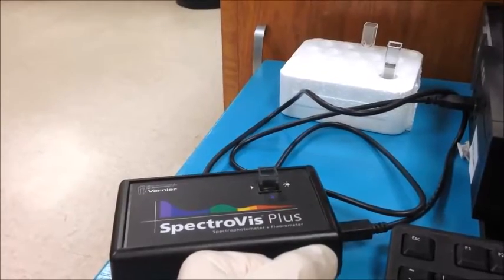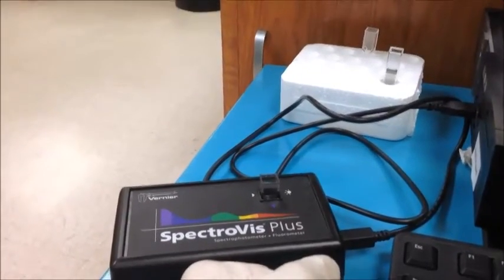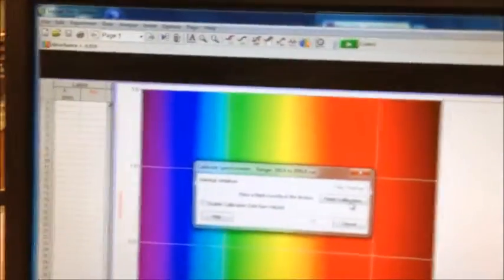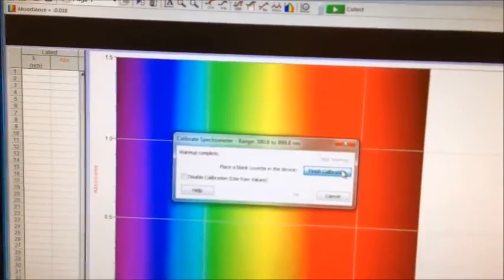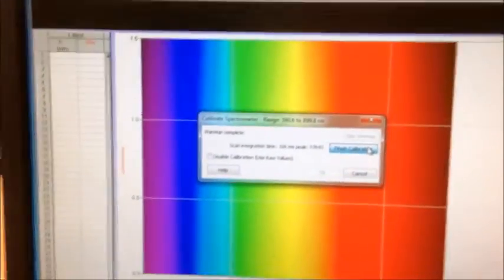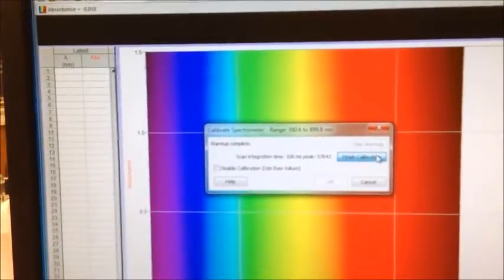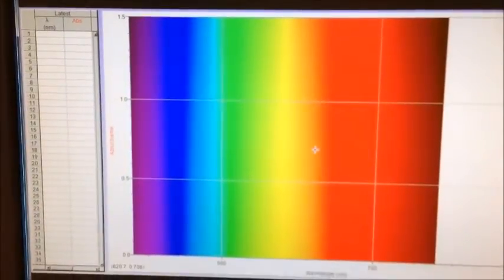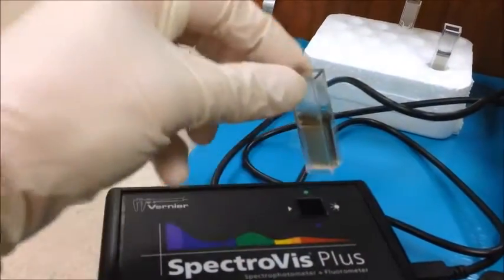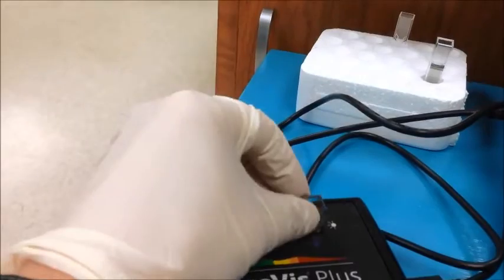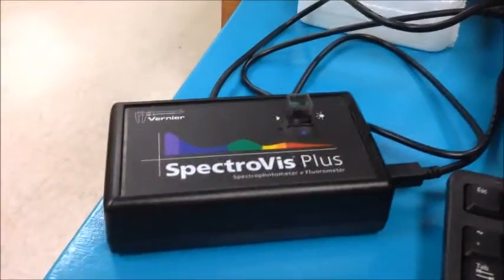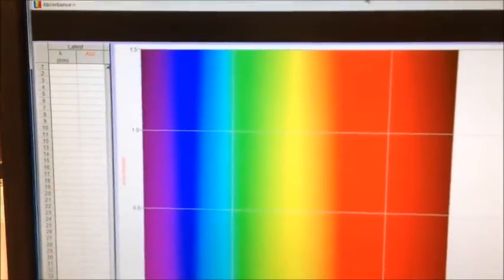Now I'm going to conduct a little experiment by doing something wrong. So once again, I have this spectrophotometer set up. I have put the Bradford reagent in to calibrate the solution. I'm going to click OK. But now, instead of taking the Bradford reagent out and putting in the reacted Bradford reagent, I'm just going to leave the same blank in there. I'm going to tell it to collect data.